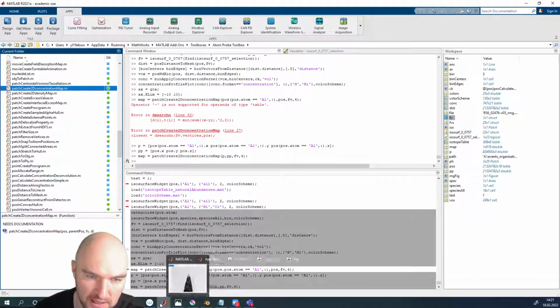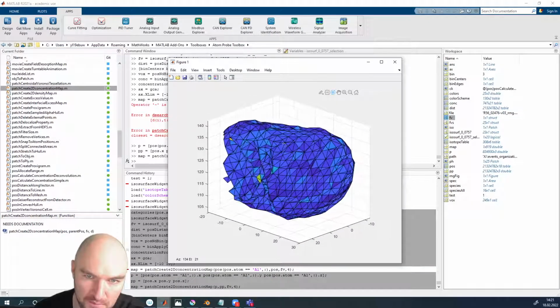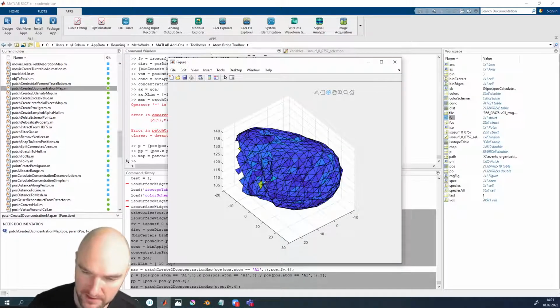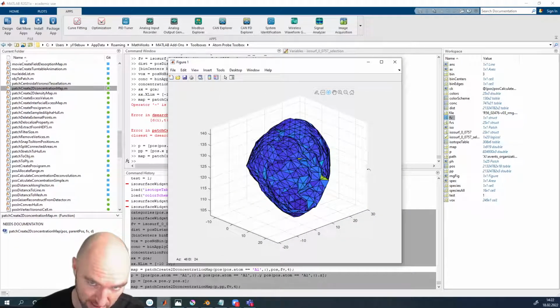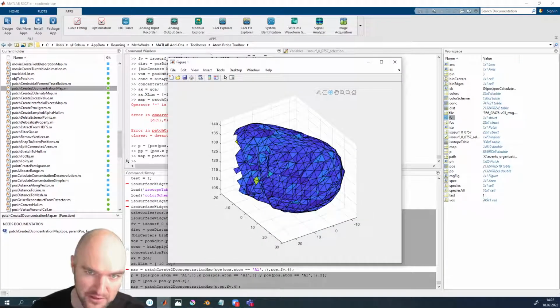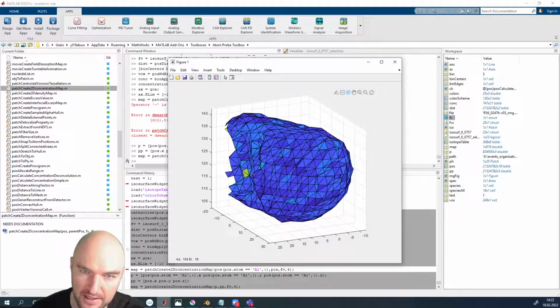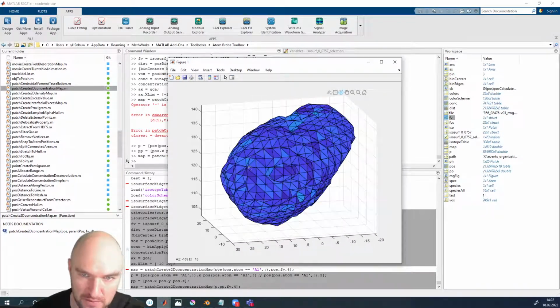And these pinch points are not really surfaces anymore at all, because locally a surface needs to have a defined inside and outside. And if a vertex belongs to two surfaces, it doesn't have a defined inside or outside. For a concentration map, we can just say, okay, we don't care all that much, because we're just not going to look at this part of the concentration map.